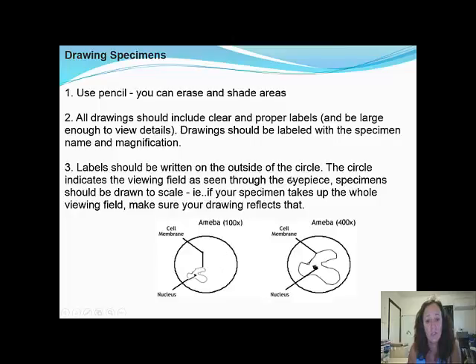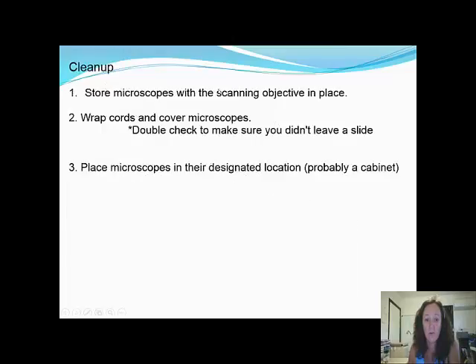To clean up: store your microscope with the scanning objective in place, wrap cords and cover microscopes, double-check to make sure you haven't left a slide on the stage, and place microscopes back in their designated location.